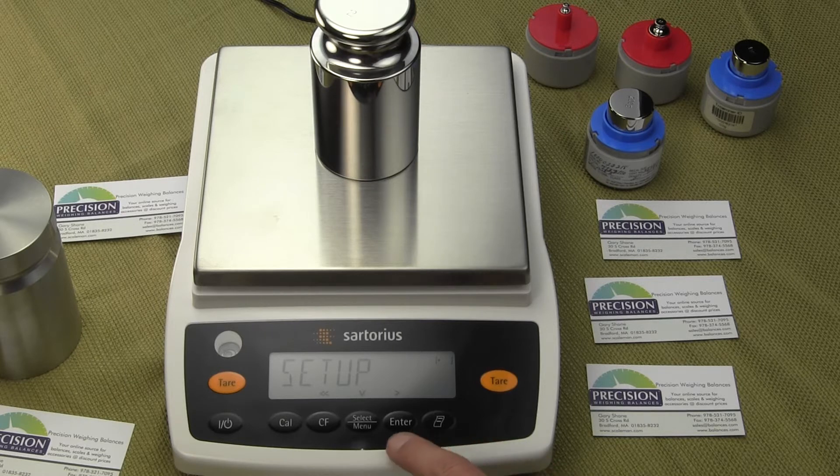Once we're at Setup, we want to hit the enter key twice to get into the setup. Press once, then twice, and you'll see Ambient. Once you see Ambient, you want to press the select key five times — one, two, three, four, five — and now you're in Unit Weight.